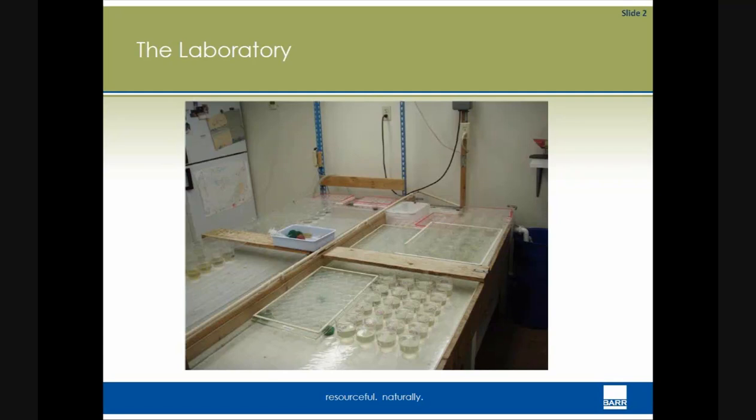It's a controlled environment. The test species are placed in those cups, and this kind of testing is called static testing. The test species, fathead minnows, and the algae, and the Ceriodaphnia, often called water fleas, are all placed in these cups, and that is placed to reside during the course of the test.